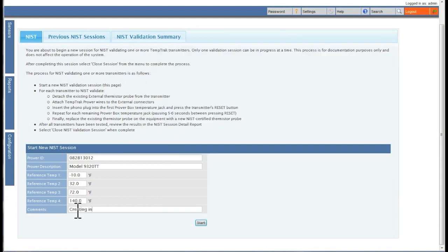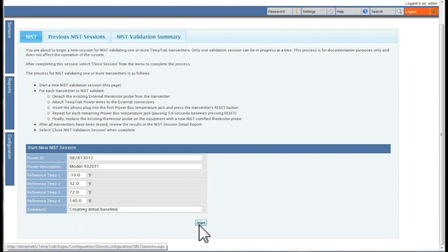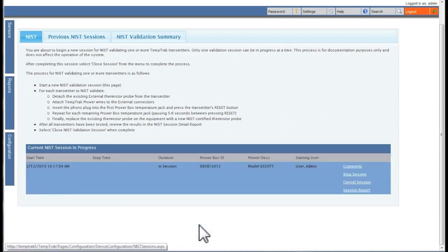You can then add any additional comments. Once you have filled in all the fields, click the Start button. Your NIST validation session has now started.